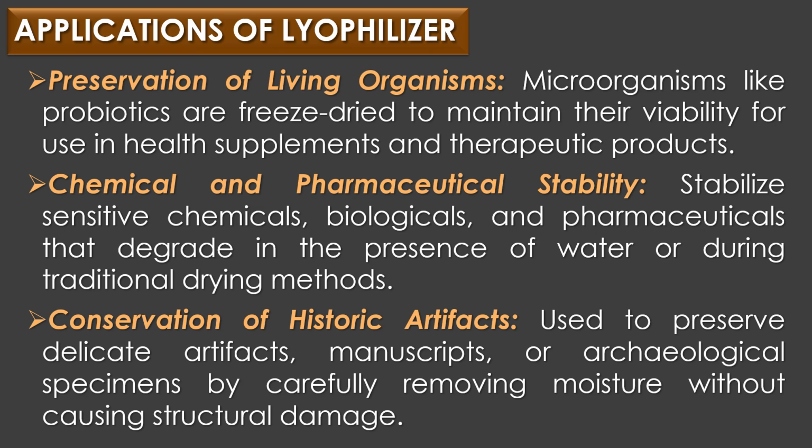and therapeutic products. Chemical and pharmaceutical stability. Freeze drying is used to stabilize sensitive chemicals, biologicals, and pharmaceuticals that degrade in the presence of water or during traditional drying methods. Conservation of historic artifacts. In conservation science, lyophilization is sometimes used to preserve delicate artifacts, manuscripts, or archaeological specimens by carefully removing moisture without causing structural damage.